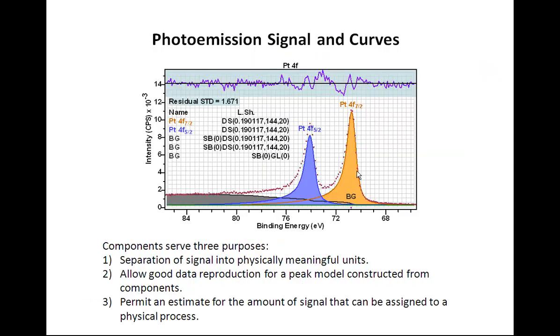When optimization is performed, a given peak model fits data with a given precision, but this is not the final target for the peak model. It isn't simply to reproduce the data. This could be achieved by other means that do not involve bell-shaped curves or curves that represent the background. The idea is that we identify signal that originates from different sources, measure the amount of substance, measure the position, and use it to understand the sample. So when we create a peak model, we must have components that are physically meaningful. For example, here we have two doublet peaks.